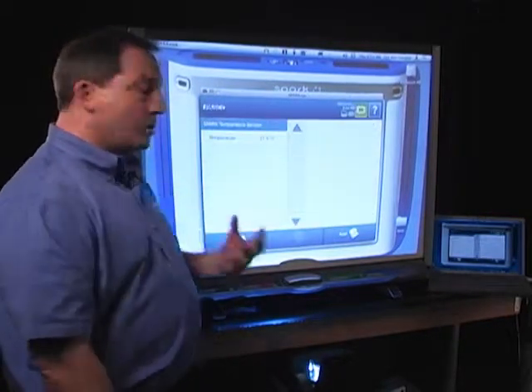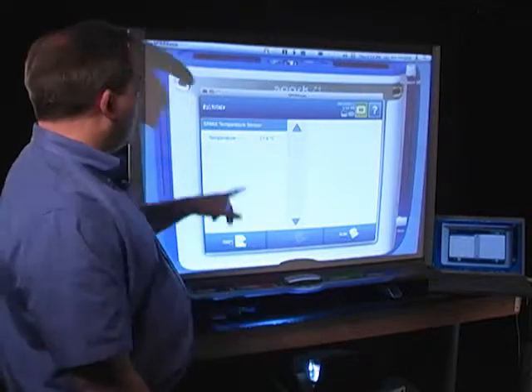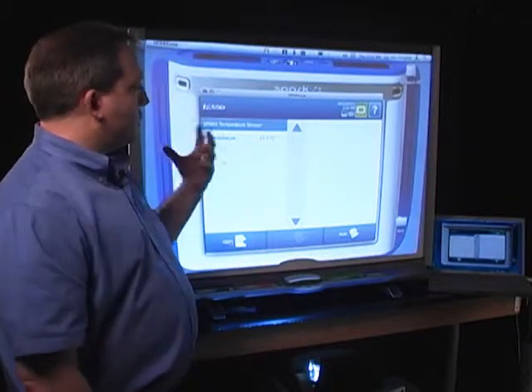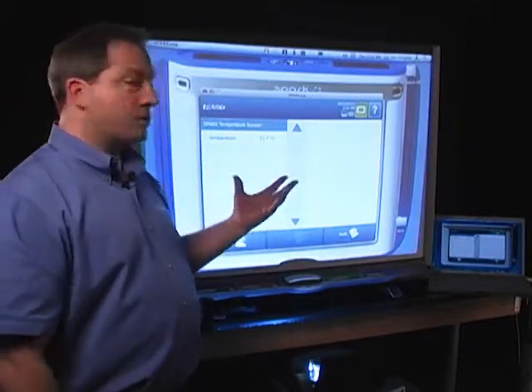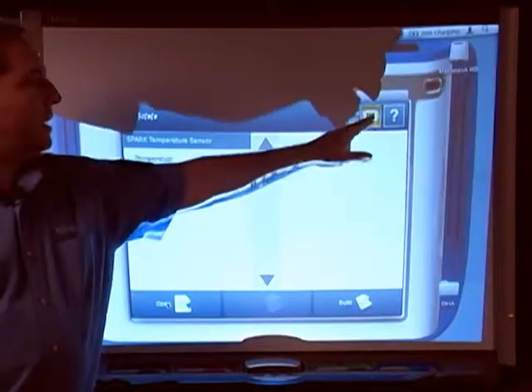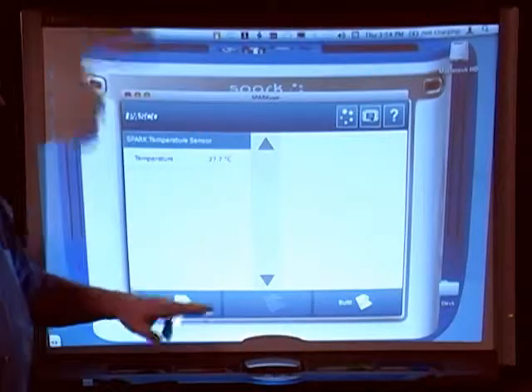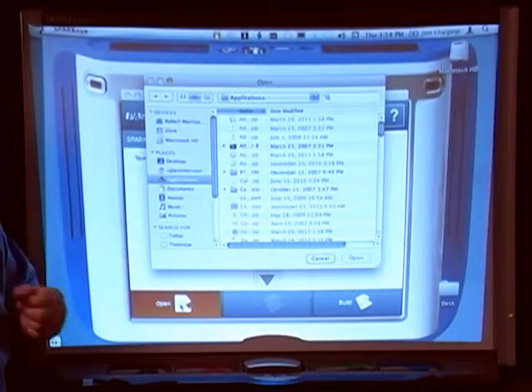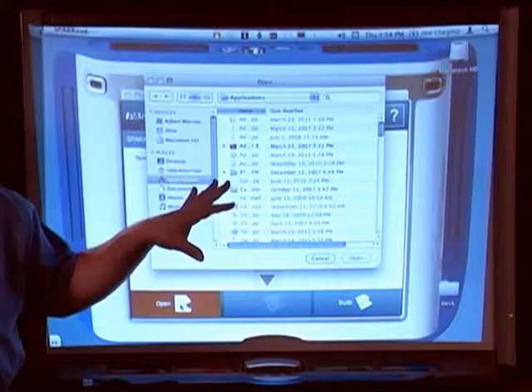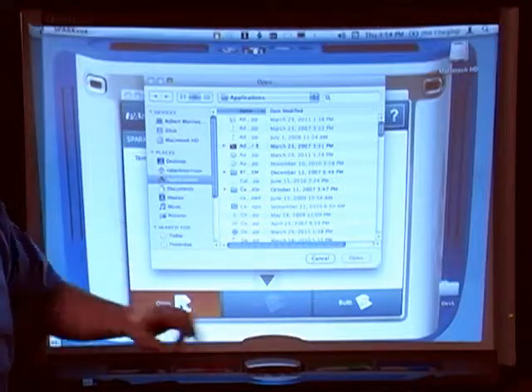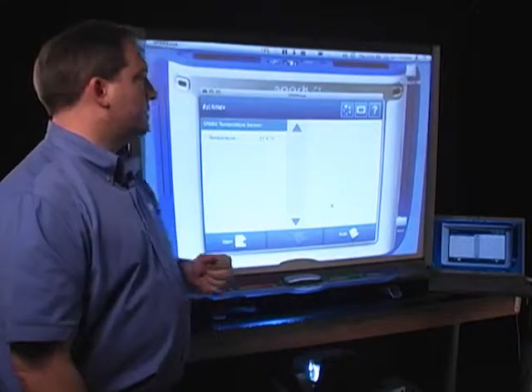If I were using computers in my classroom or if I just wanted to show students how to use the software if I was doing a demonstration, I might want to use the full version. And if I were using that version and I would hit open, it's going to use the regular menu system of the computer. So that's one of the key differences.